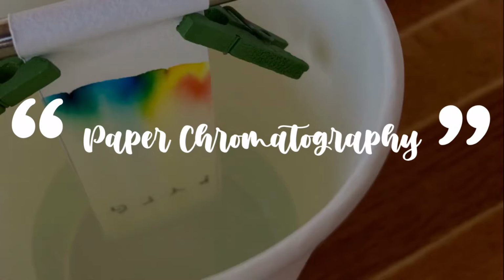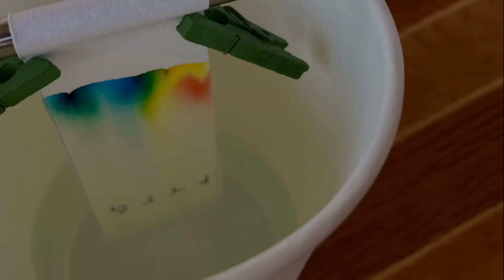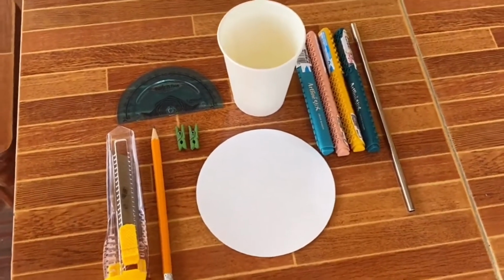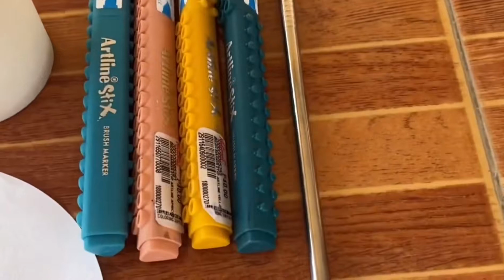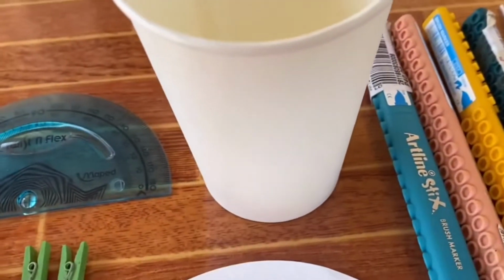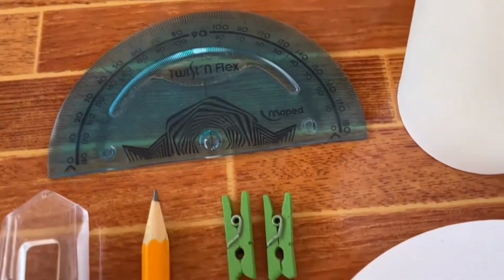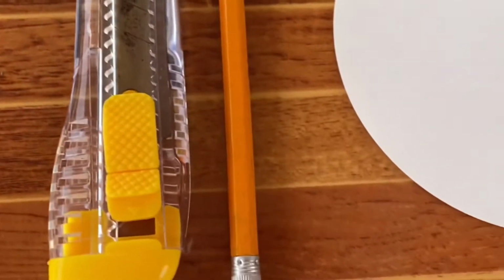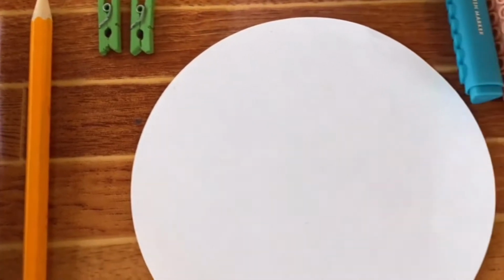By definition, paper chromatography is used to separate one color from a mixture of colors. These are the materials needed for paper chromatography: straw, different colors of marker, cup with water, ruler, clips, pencil, cutter, and of course, the filter paper.